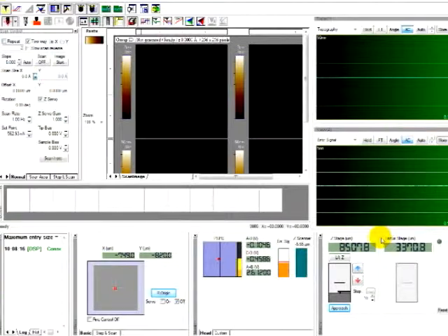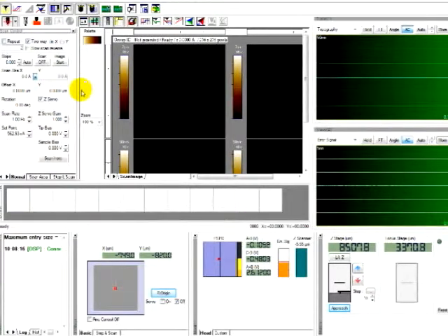Either contact mode or non-contact mode, you ought to know how to align the laser and also PSPD alignment before doing it. So make sure you know how to do it. Okay, so we'll show you first how to control the parameter setting in contact mode.